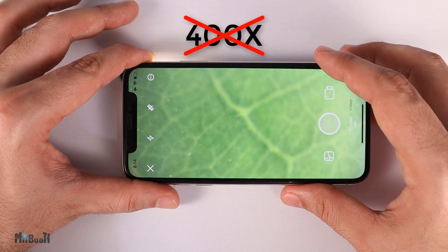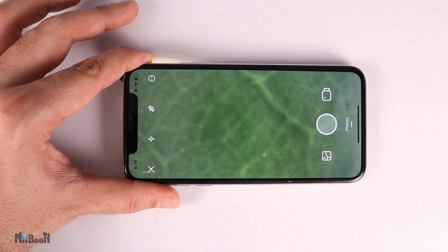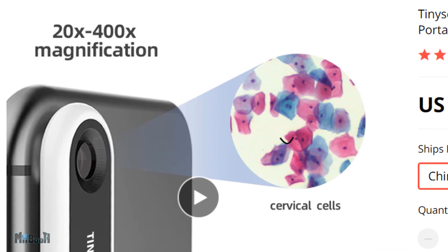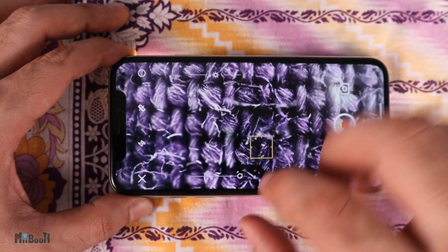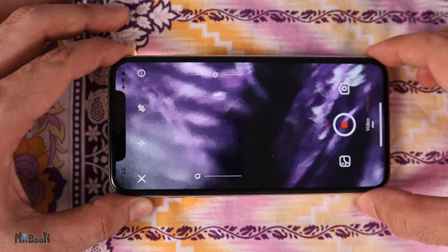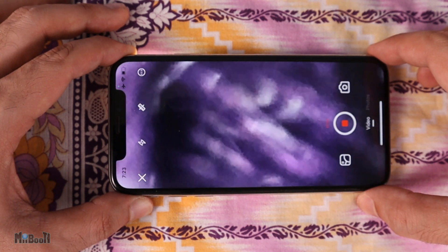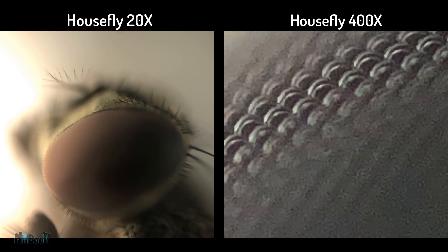Now you might be thinking that's not 400x magnification — that's barely 25x — and you'd be right. After some research, it turns out the product claims a magnification of 20 to 400 times. The lens itself is not variable, so what they mean is: the TinyScope app has a built-in 20x digital zoom, which combined with the 20x optical lens reaches 400x. The actual optical magnification is 20x. Now here are the same samples shown at 20x next to their 400x versions — you be the judge.